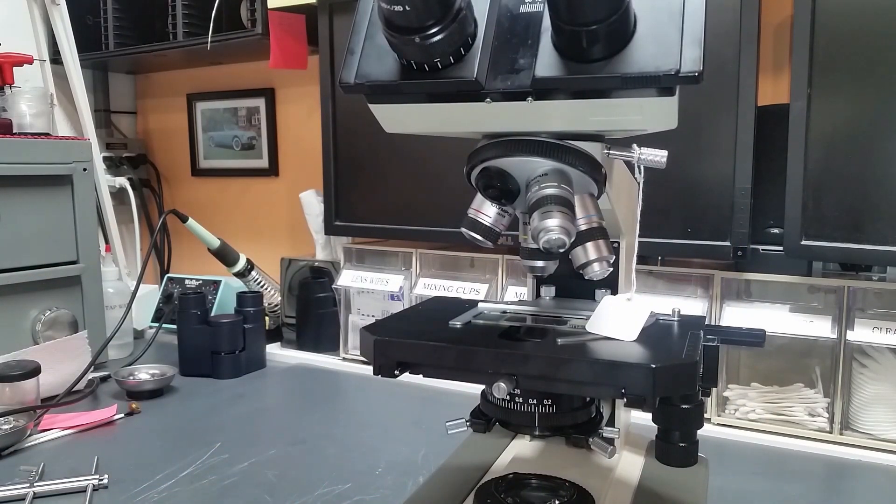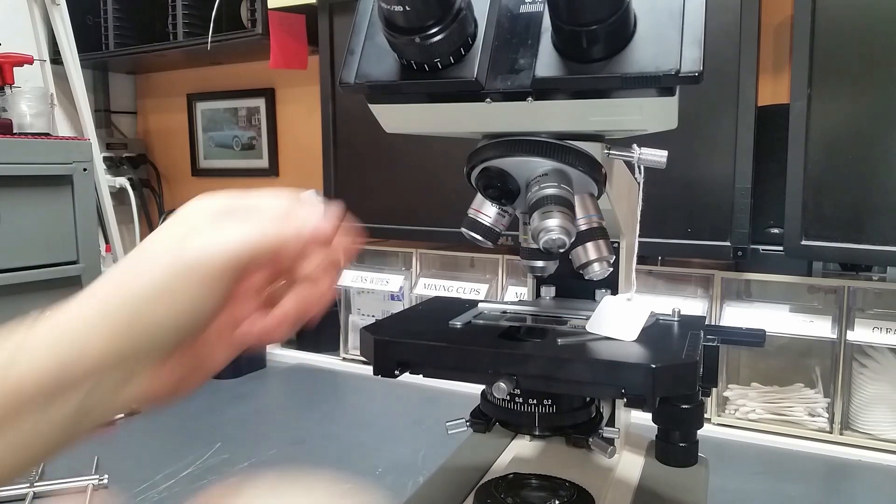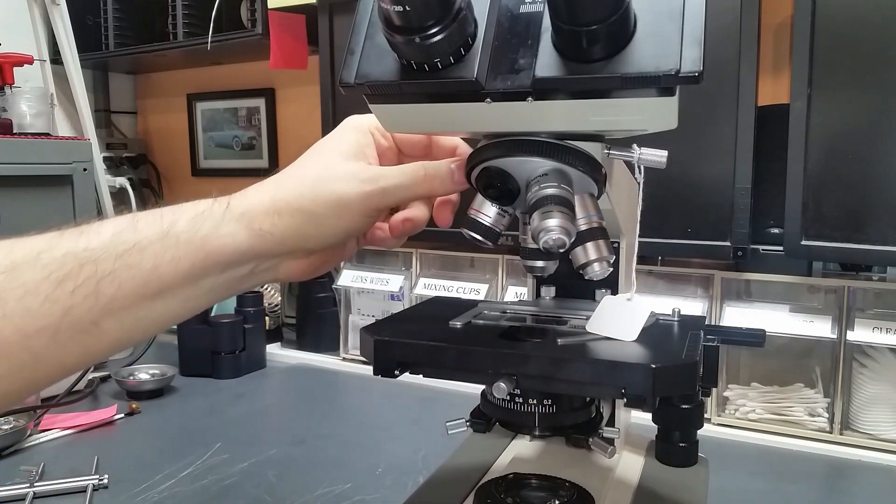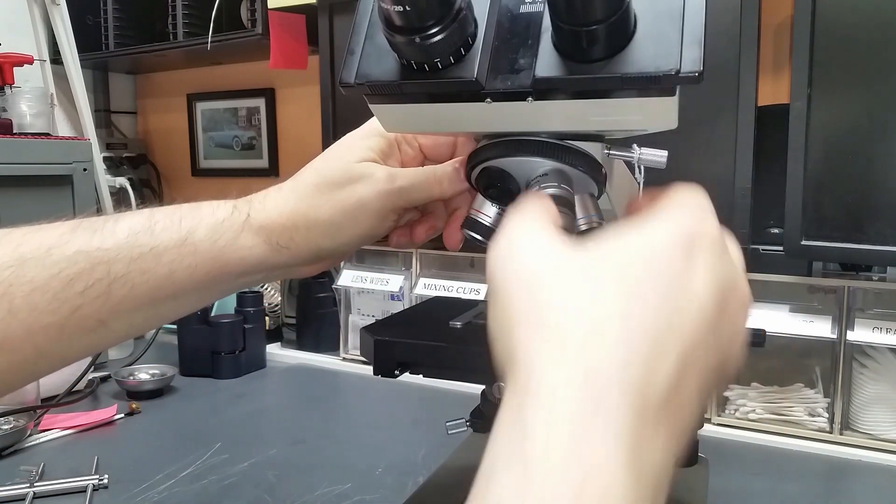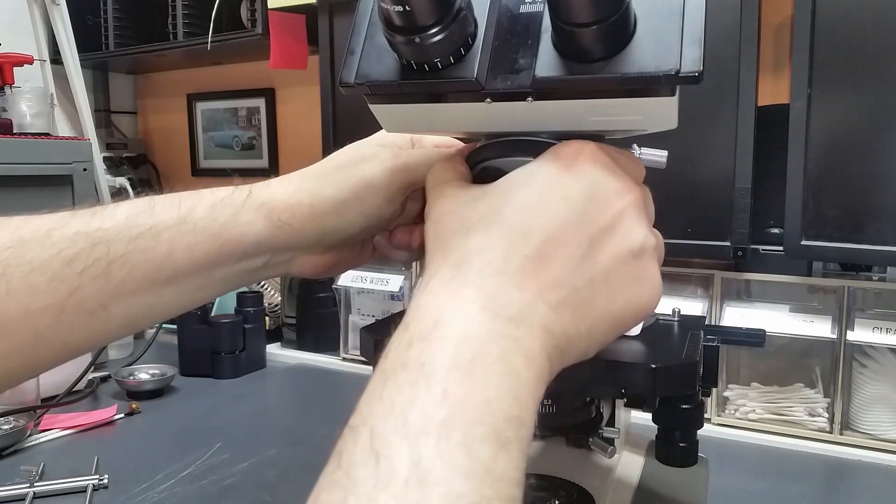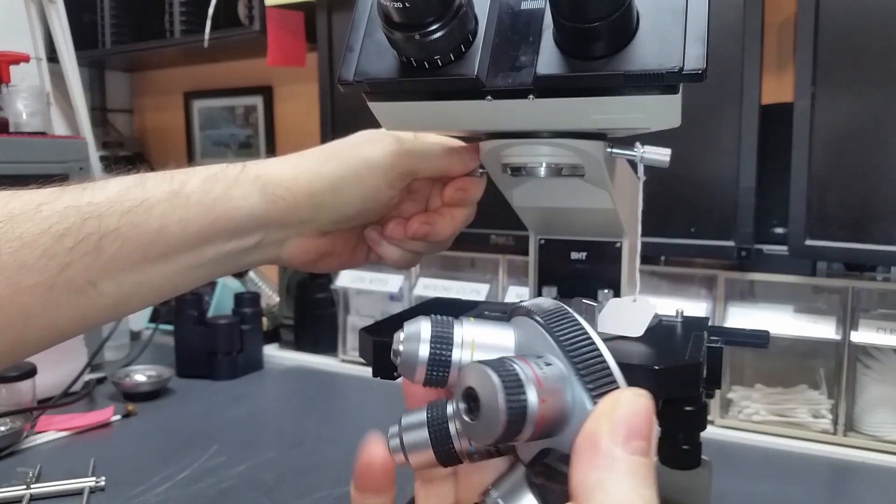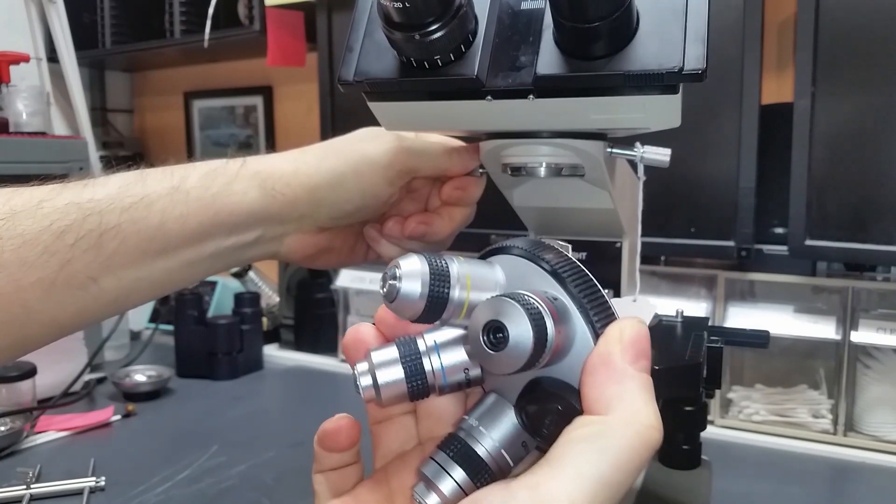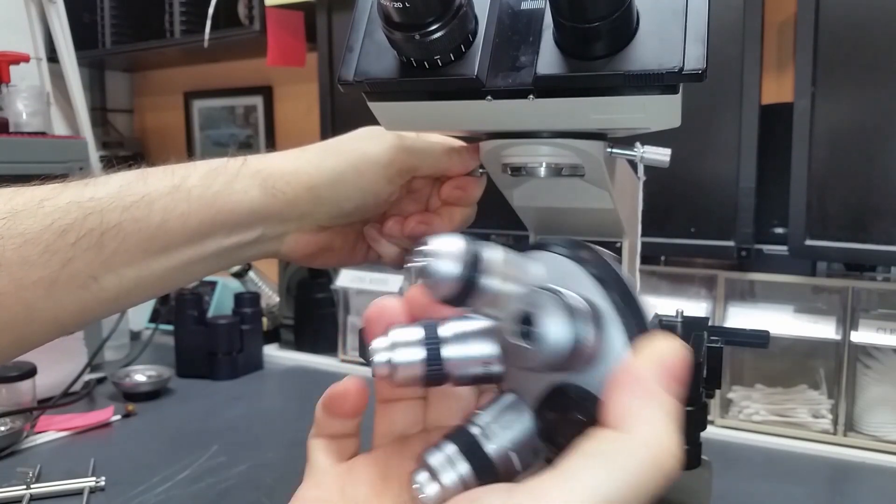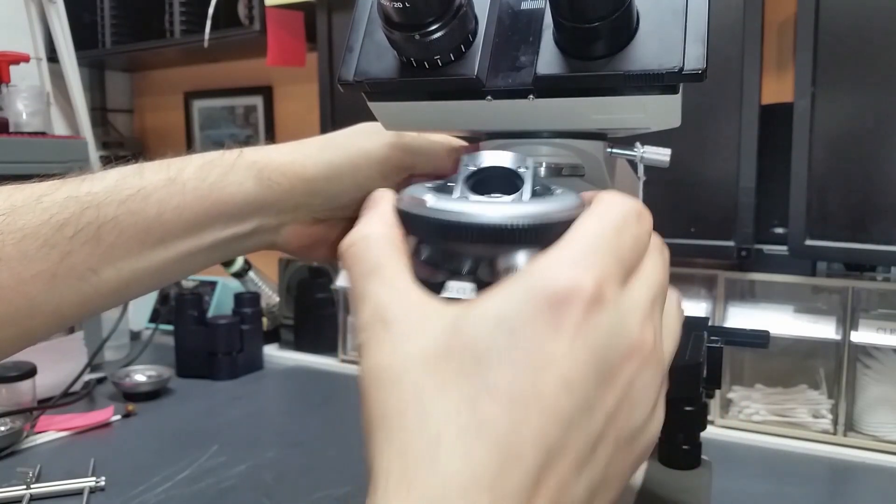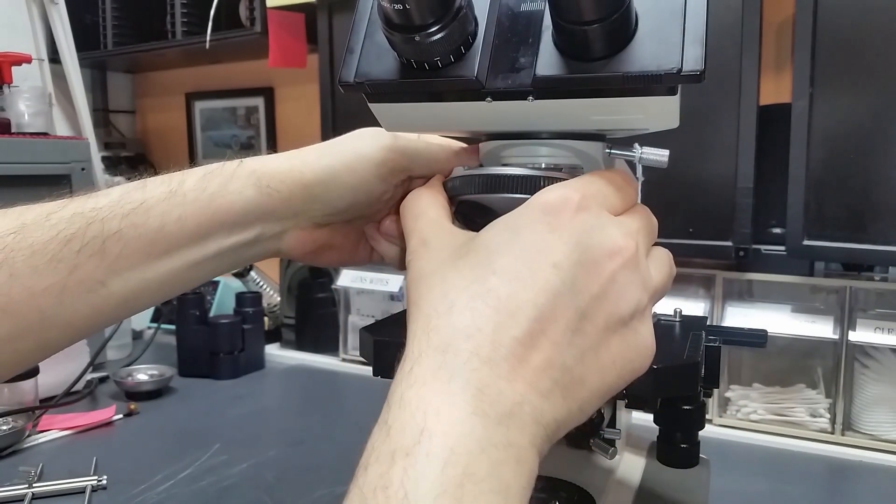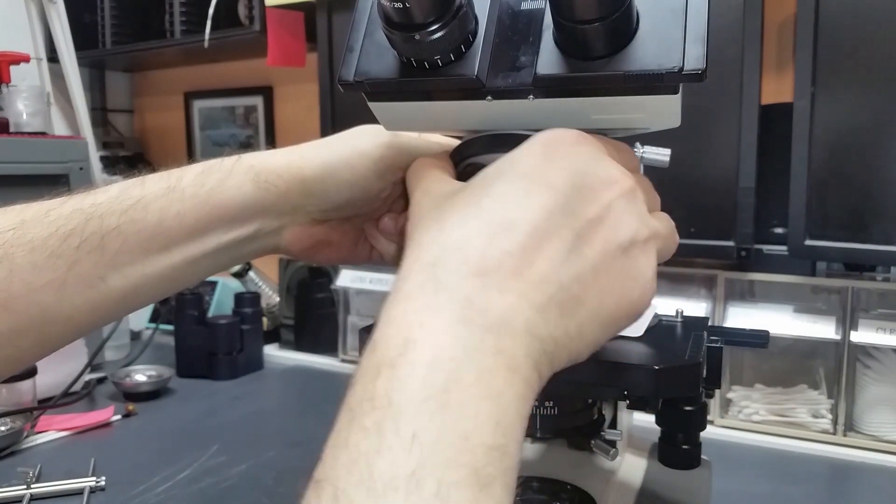Since this is a BHT scope instead of a TU scope, there's a little thumb screw here that you can loosen up and take out the entire turret nose piece with objectives intact, which is a real handy feature on these scopes.